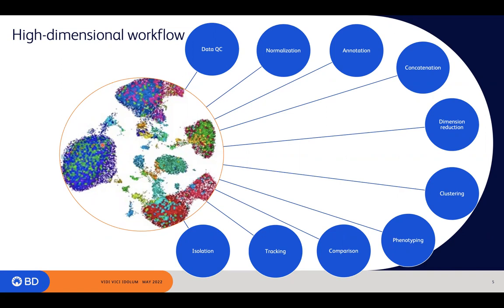Also, if you're collecting data over multiple sites that are spread geographically, so for example, you may have a cytometer in Los Angeles, another one in New York, another one in London, right, and who knows where else around the world, and you want to make comparisons between the samples or the patients that you collect in all of these different locations. And so normalization is useful for amalgamating such data.